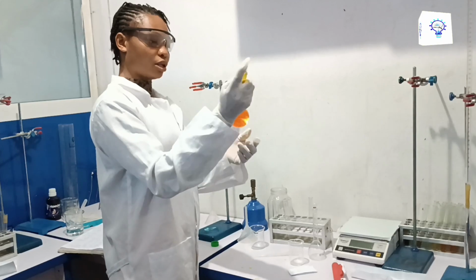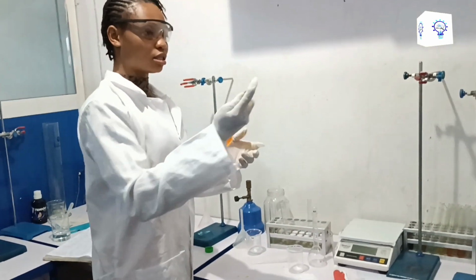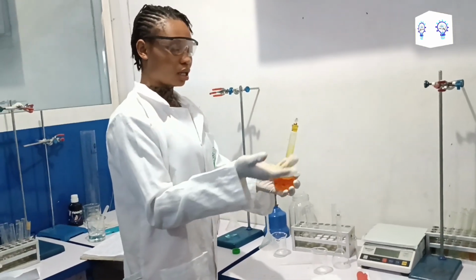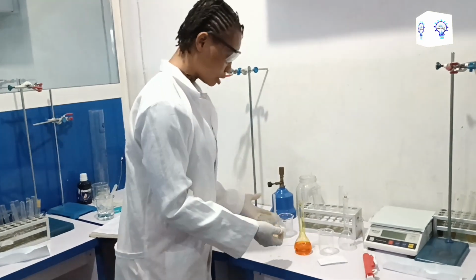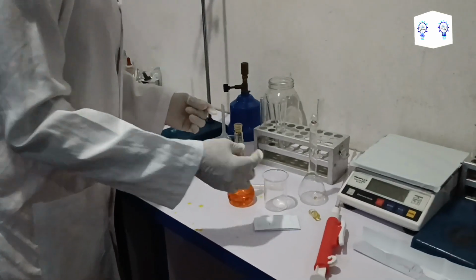Safety is very important. This is my volumetric flask. As I touch it, it is not well tight. That is the reason it's looking like this. So the hand gloves have been able to protect my hand from it. You can see everywhere. So safety is important in the lab.